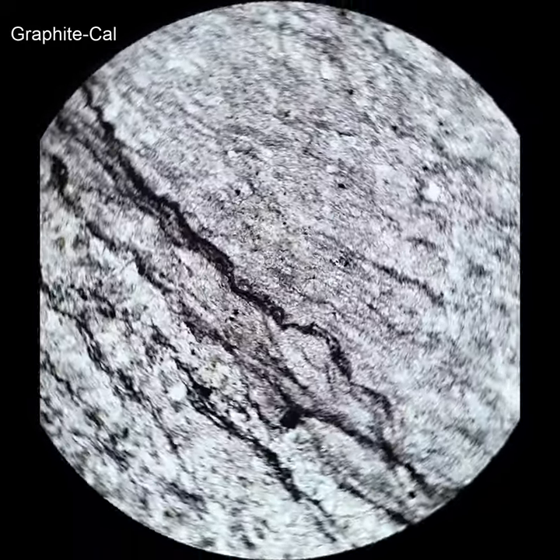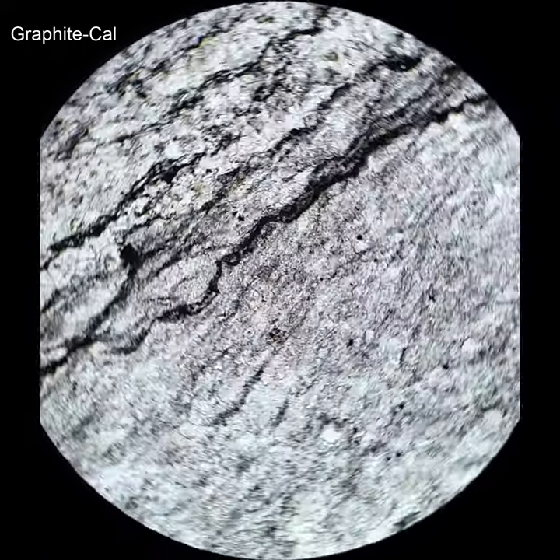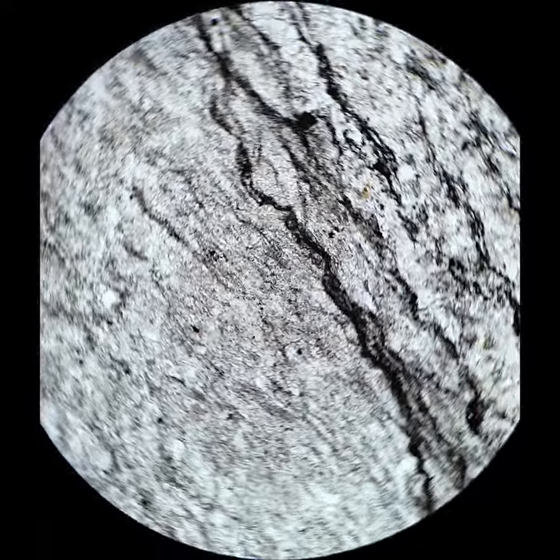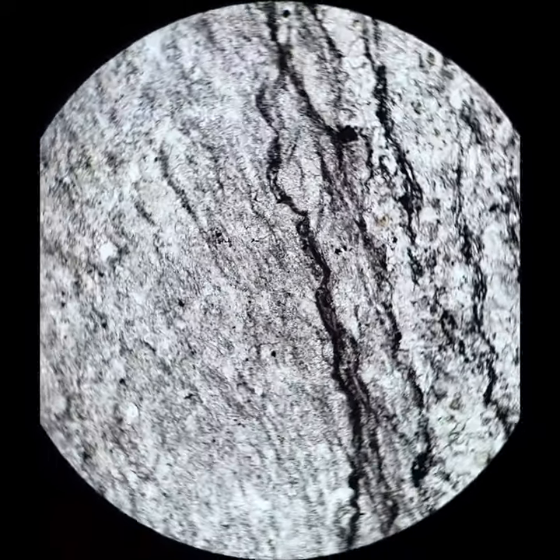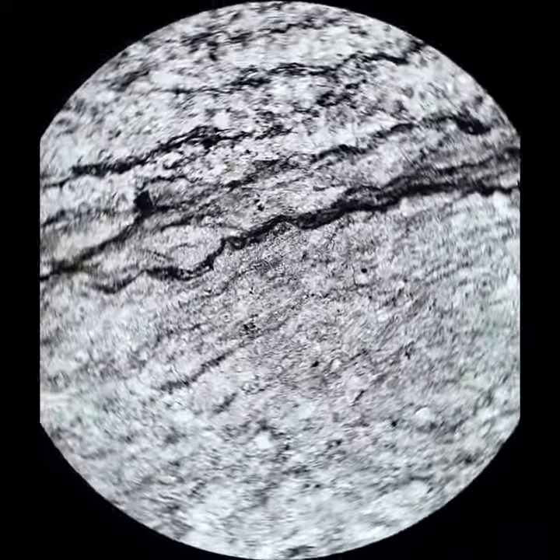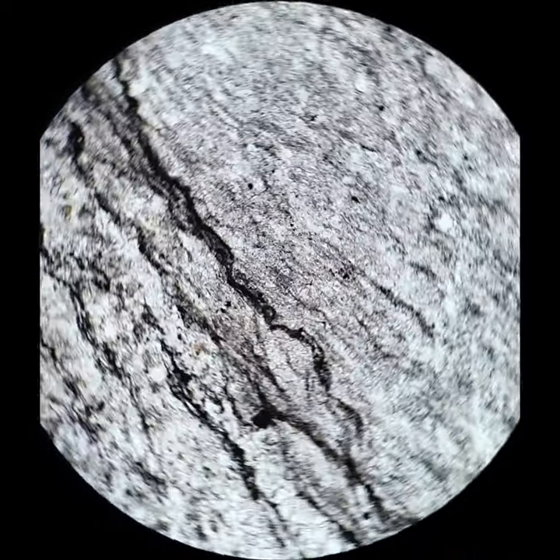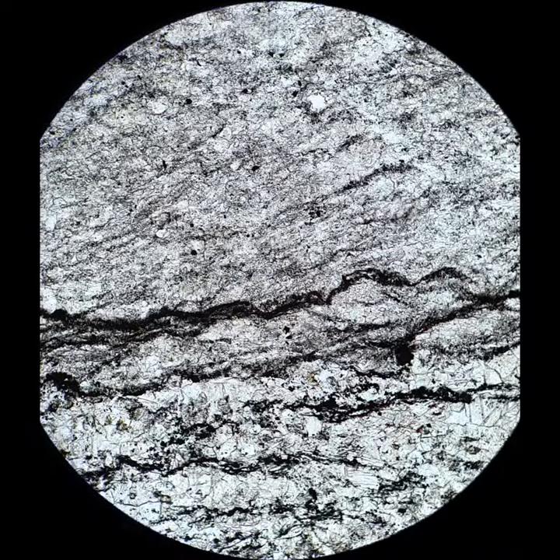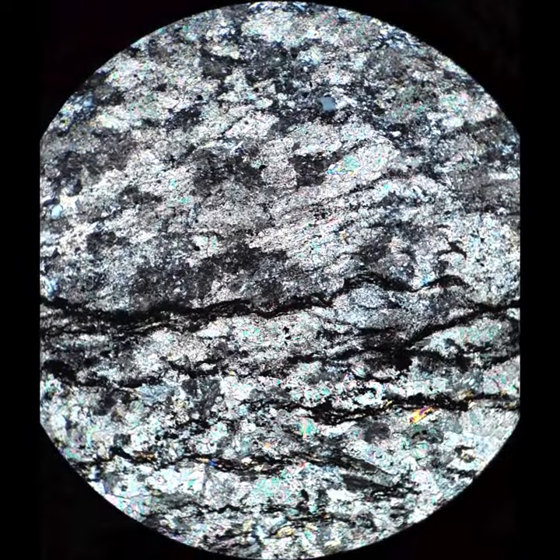This is a graphite marble. Graphite is all the super fine-grained black stuff in there, and that's typically what graphite looks like — it's just fine-grained. It forms these little bands, and a lot of times they reflect original sedimentary bedding.